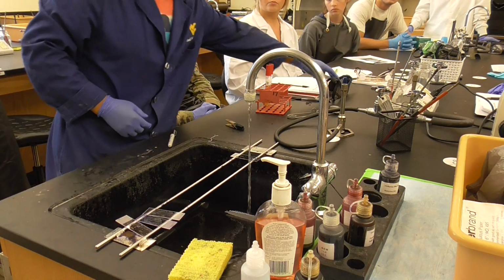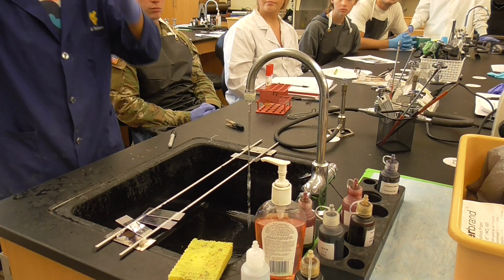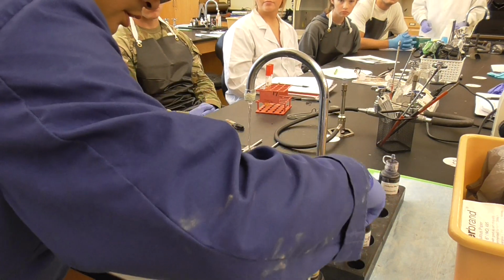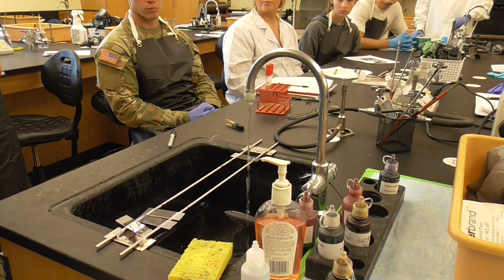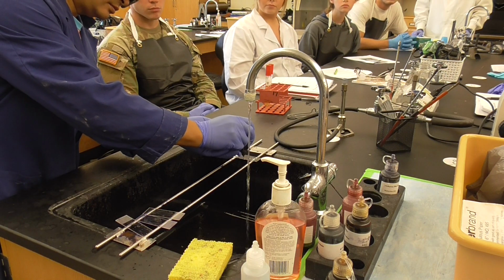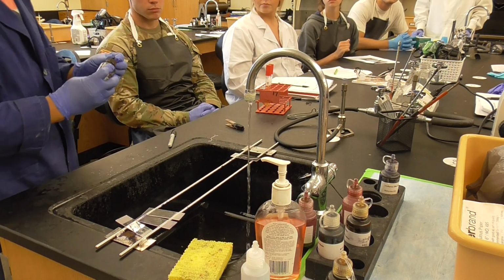At this moment, you need to wear the goggle, because we are doing the stain. Okay, I'm gonna pick one to do. Let's just do crystal violet, which is simple. Which one is crystal violet? The purple. So we're gonna do the stain. Cover the circle. Uh-oh. Sorry, that's not good.